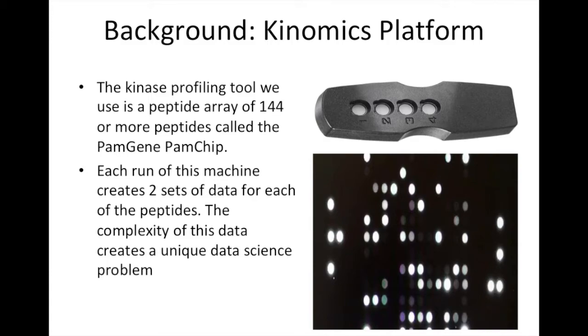The general idea is that a specially prepared cellular lysate is added to each well of the chip and allowed to act on the kinase targets present in the microarray. As the kinases act on the targets, specialized fluorescent antibodies bind the phosphorylated residues, allowing the phosphorylation to be quantified as a measure of fluorescence. In other words, for an image of an array like this, a bright spot, such as this one, has had more phosphorylation occur than a lighter spot, such as this one.